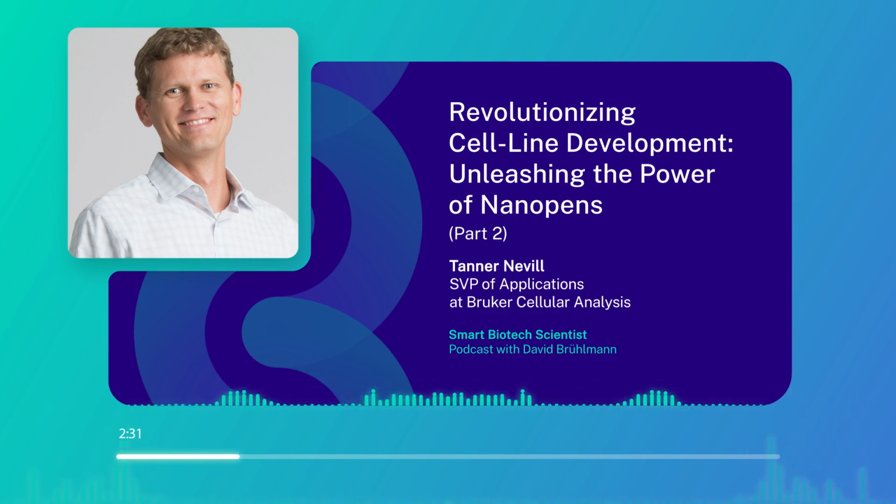Depends on where the testing is, but if it was up to me, I would utilize all that AI learning to engineer and create as many supposedly valuable products as possible. I would pull the cell line development process in, start with clones earlier, and pull that functional testing in and try and answer those questions faster. Because I think by doing that, you're going to increase your throughput to take in more and more.